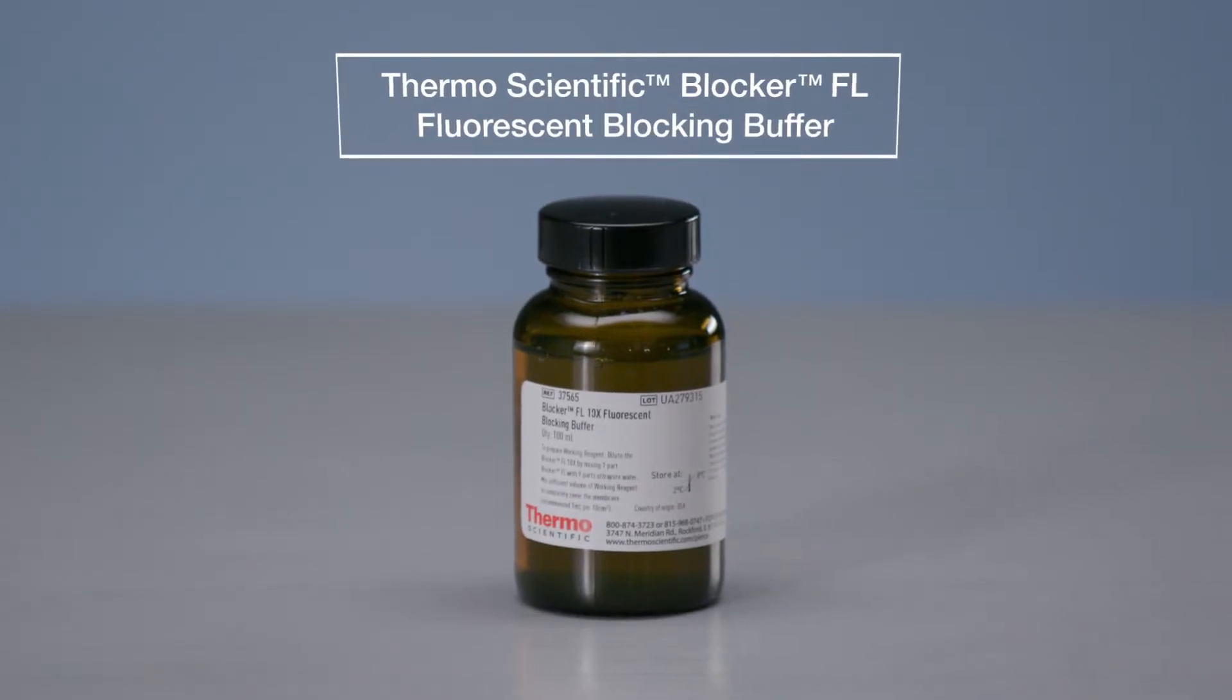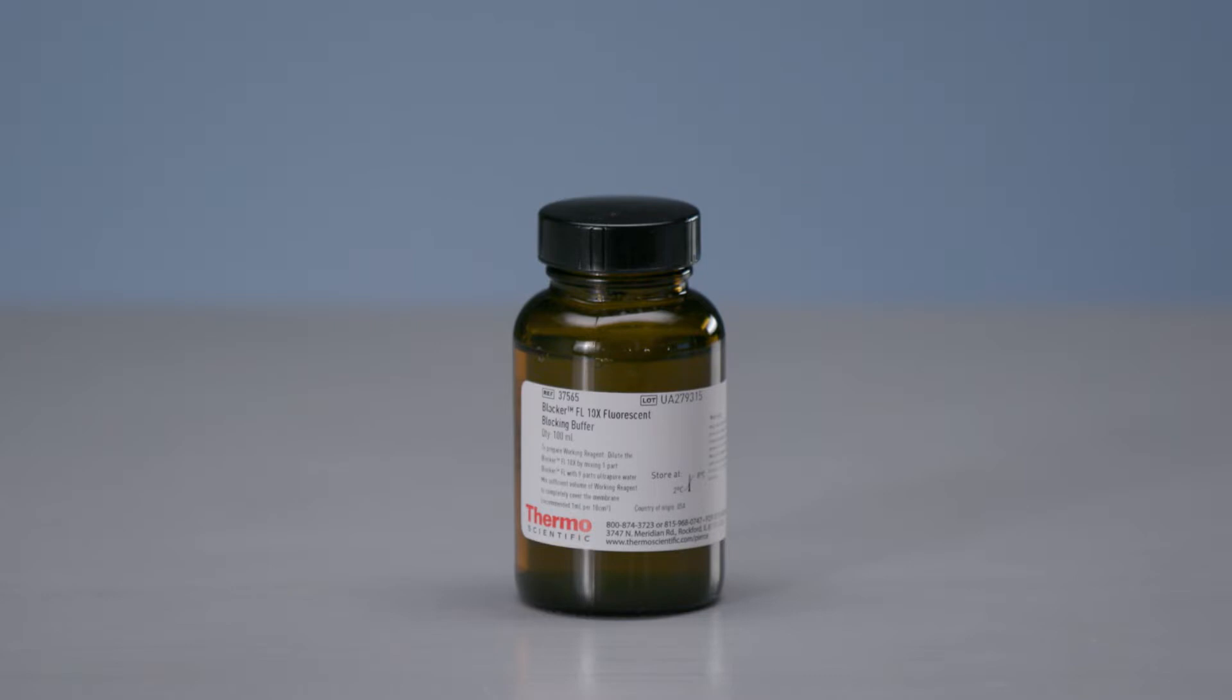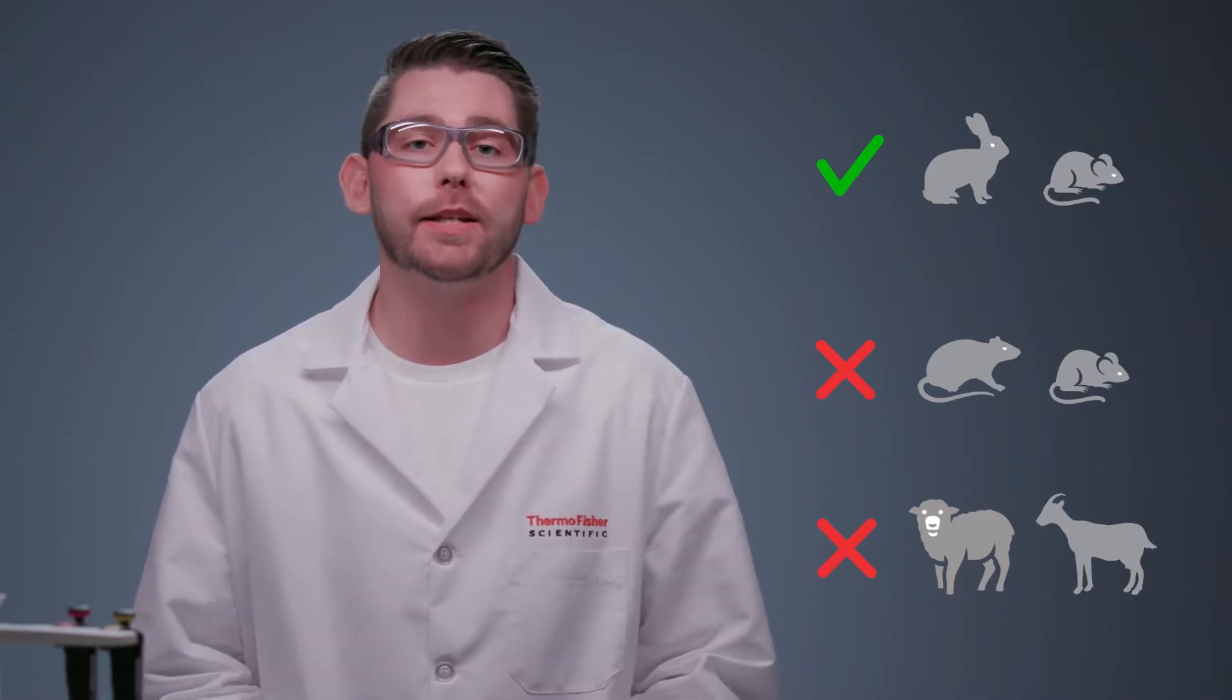Use only detergent-free blocking buffers as common detergents autofluoresce and will increase background. The selection of appropriate primary antibodies and fluorescently labeled secondary antibodies is critical when designing a fluorescent western blot experiment. For example, when performing two-plex multiplexing experiments, use primary antibodies from different host species to avoid cross-reactivity. Ideally, use a combination of antibodies from two distantly related species, such as mouse and rabbit, avoiding combinations like mouse and rat, or goat and sheep.